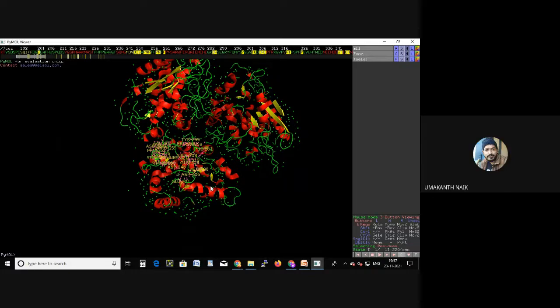So is there any doubt in doing this particular PyMOL hands-on demonstration, while editing the chains, or when you're selecting the Angstrom region, or the particular pocket chain identification, or seeing how many lysine residues there are, or when you're selecting the color representation? Are there any doubts? No. What about you, Preeti ma'am?